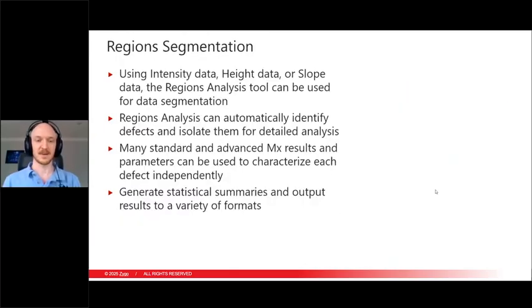And today, when we talk about our defect analysis, we'll be using regions segmentation, which is a tool within MX. And regions allows us to segment our data and isolate defects to provide us with that very detailed analysis of each defect independently. And many of the results that are available in MX standard can be found in regions, and we can apply those to all of our defects.